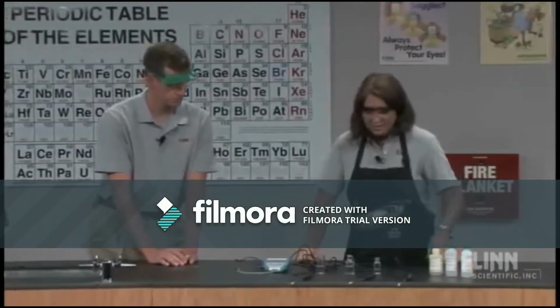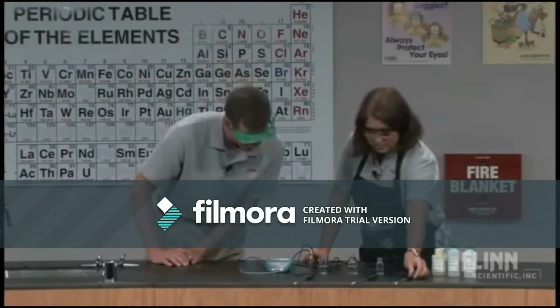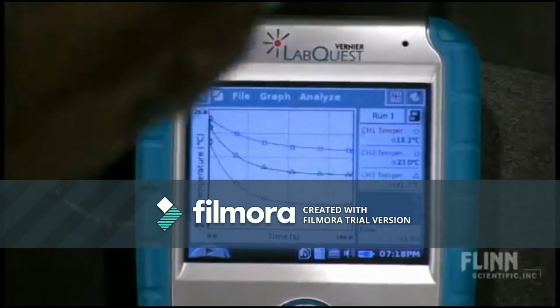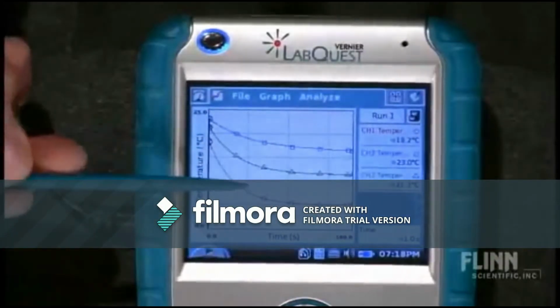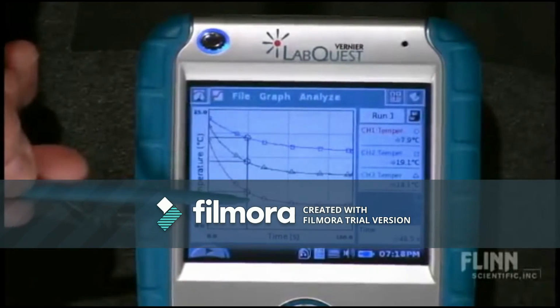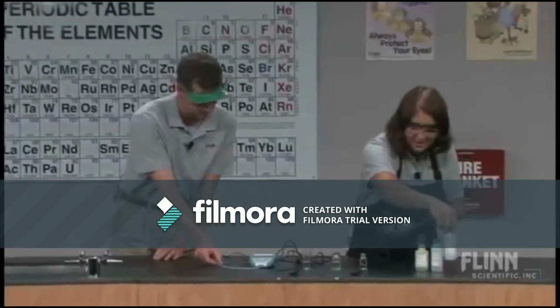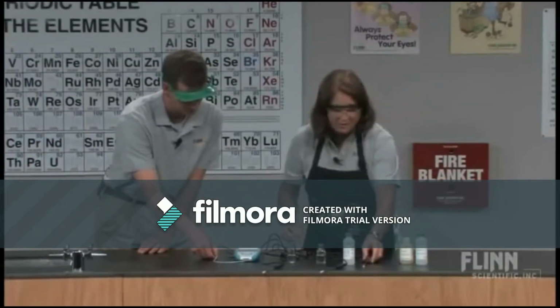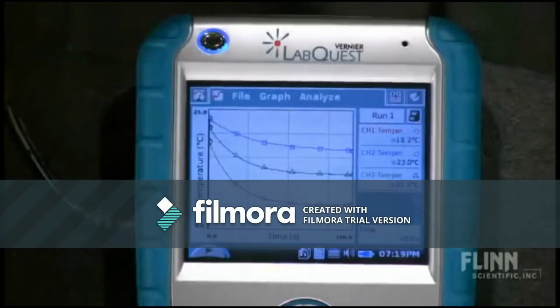Okay, so Mike, can you tell me by looking at the screen which one of these was in channel 1? Channel 1 is the very, very bottom graph. This is our methanol. That evaporated the most. Here's our methanol bottle, methyl alcohol. And what's in channel 2? That would be our orange one here, channel 2. Channel 2 is the highest one.